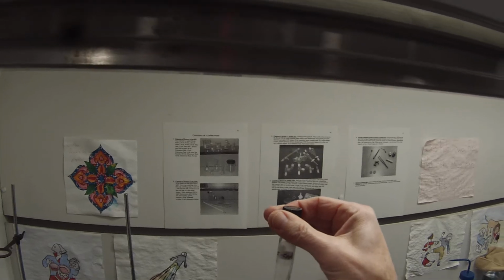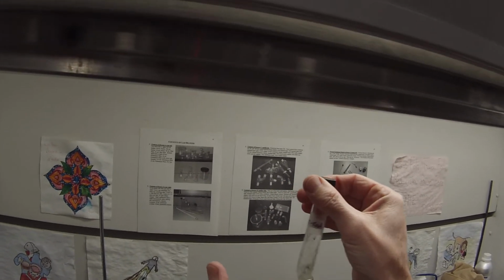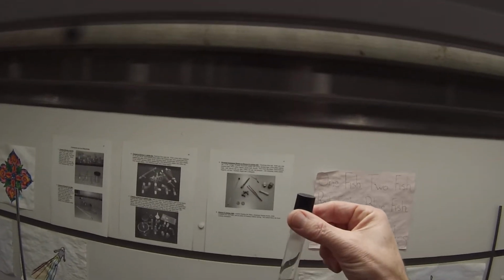So we're going to cap that up, and we're going to mix it thoroughly. We want to make sure that it's clear, not cloudy. We still have a little bit of drying agent that kind of bounces around, and I may have to add a little bit more to accomplish that. We don't want any water when we do our distillation next week.